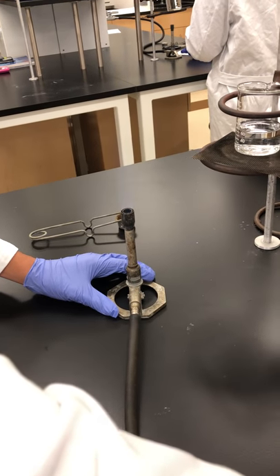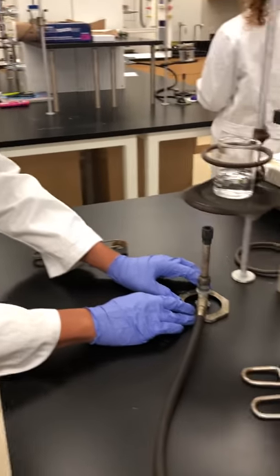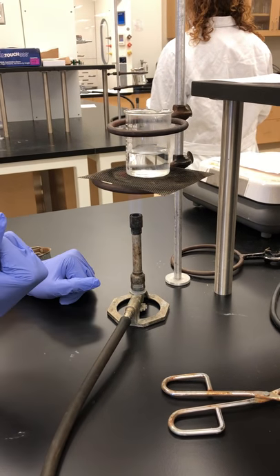Adjust the flame lower so it's right where the beaker is going to be. Place it right underneath it. Get a nice blue flame that's touching the very tip of the beaker. I'm just going to wait for it to boil here.